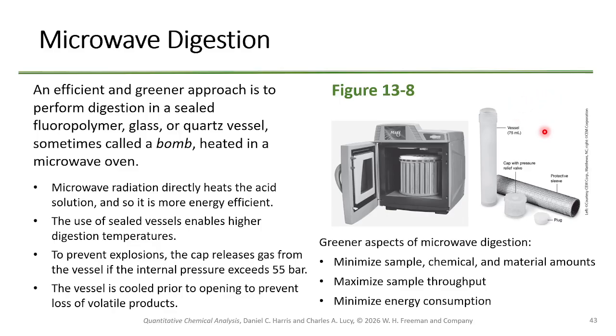What would happen if you open this prior to cooling, by the way? Anybody use a pressure cooker? What happens if you open the pressure cooker prior to cooling? It explodes. Yeah. And so never open one of these prior to cooling. Not only can you lose product, but it's going to violently spray acid in your face and whatever you happen to dissolve in it.